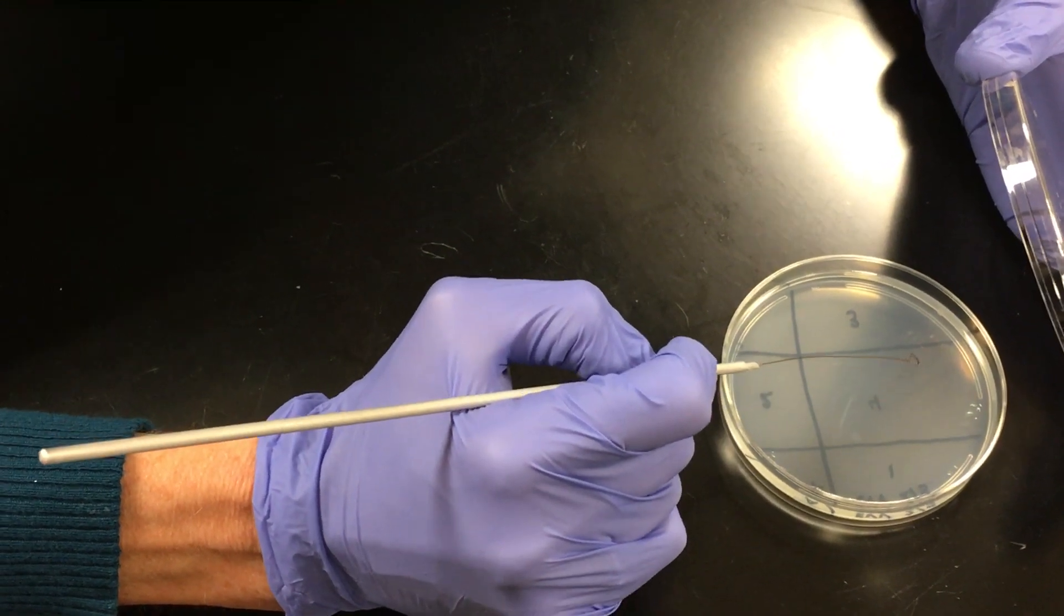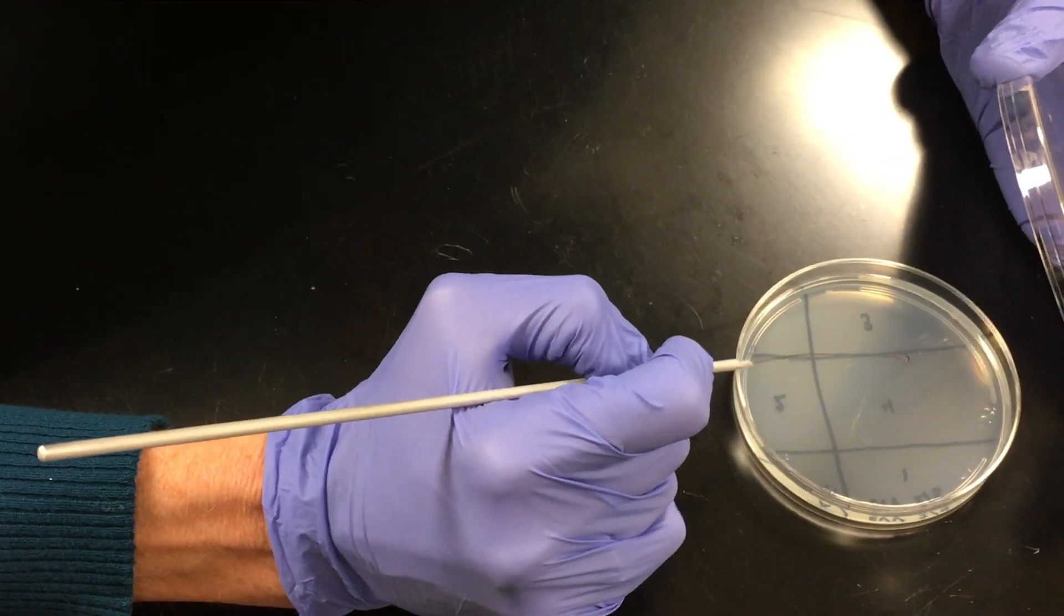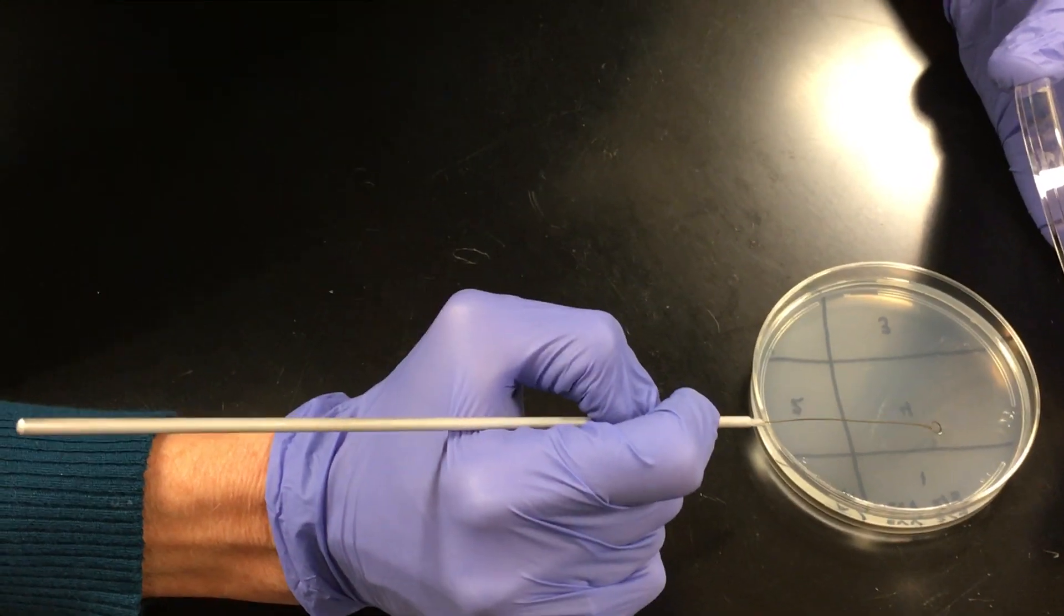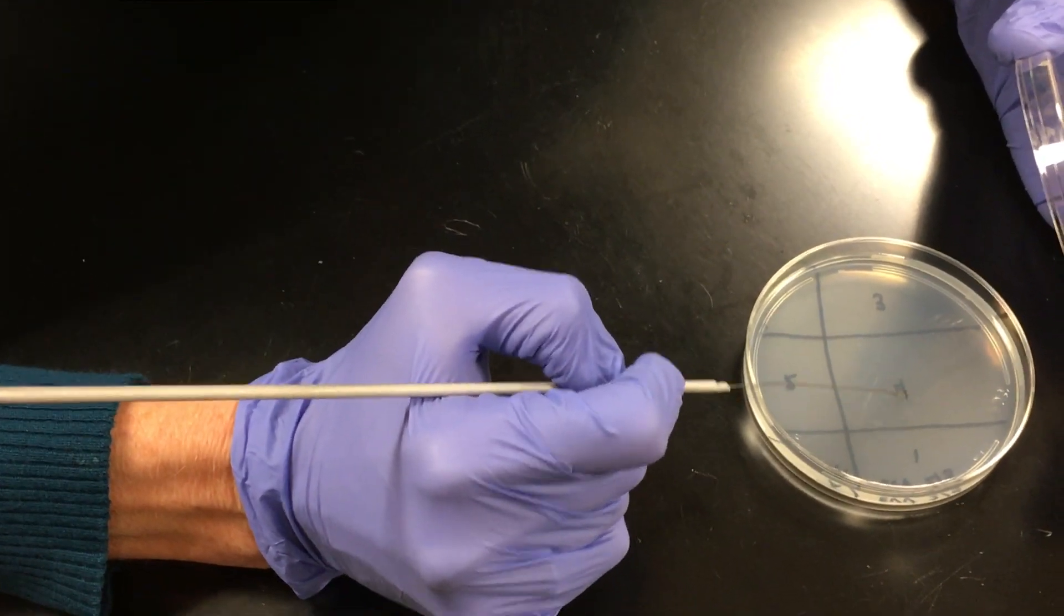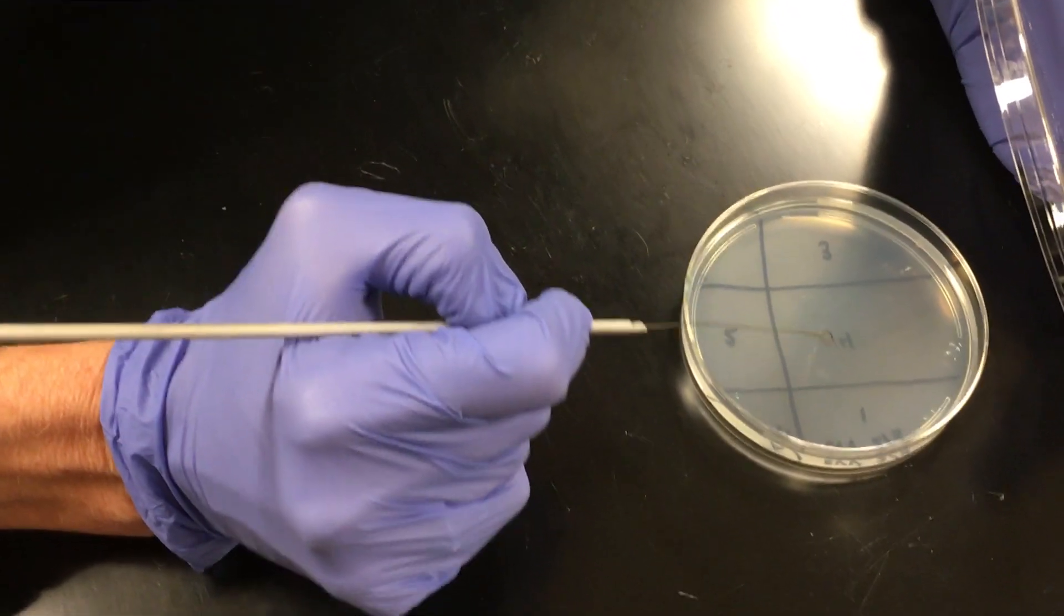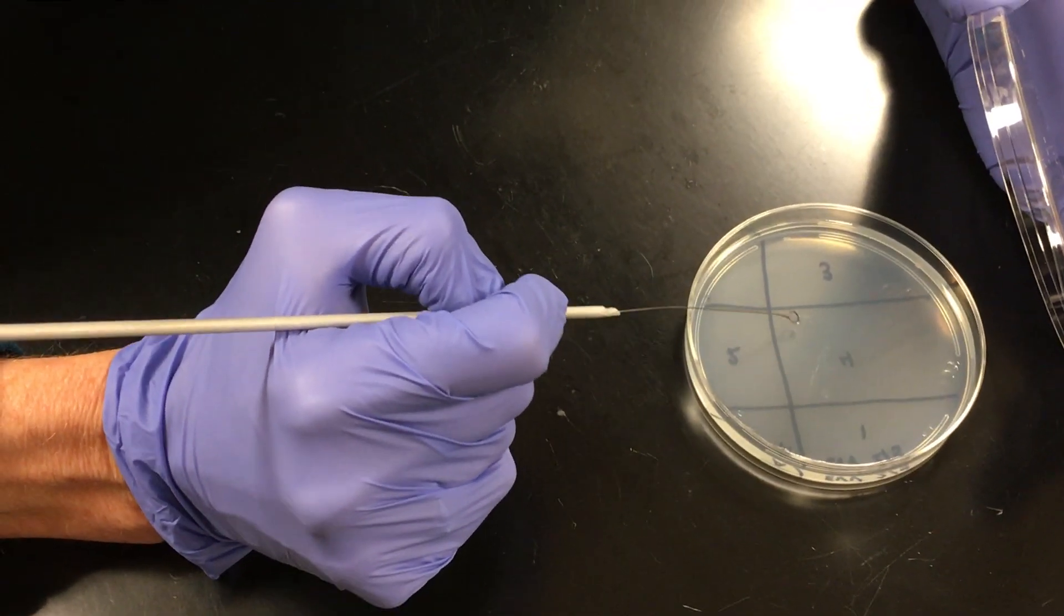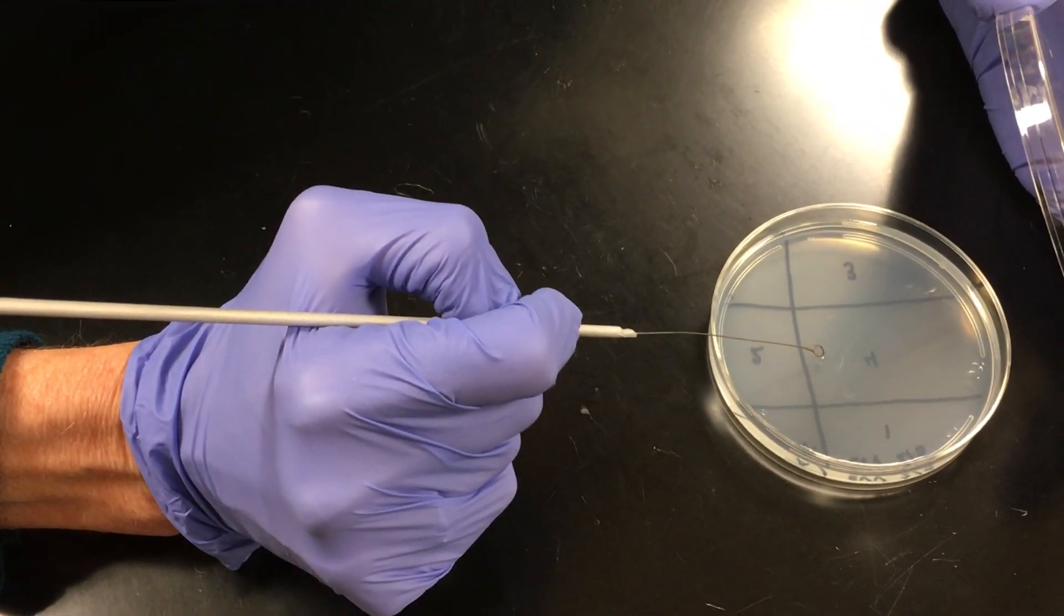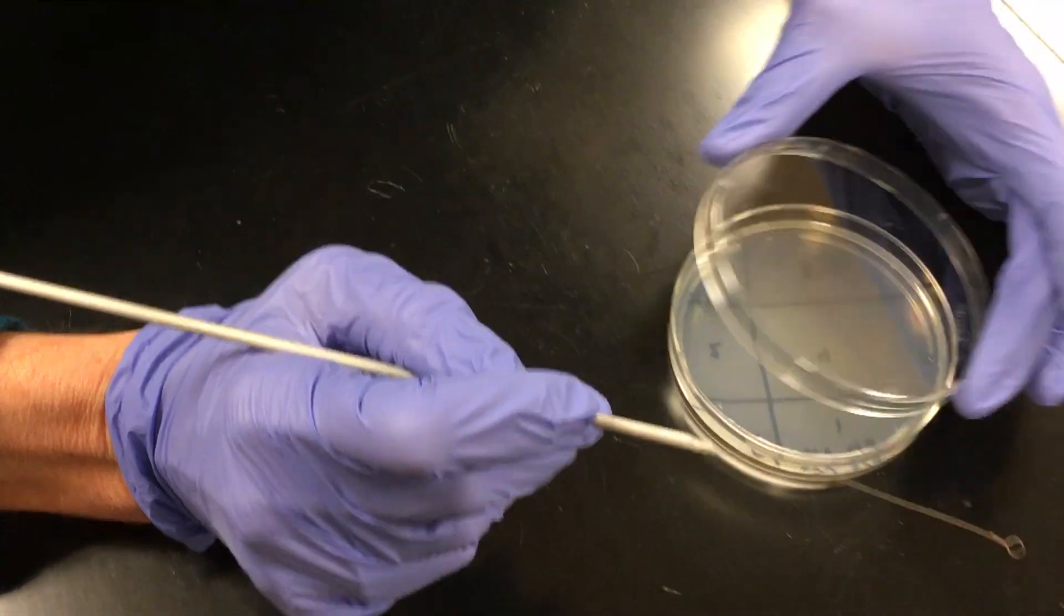Now I'm just going to streak across quadrant four and I'm trying to isolate bacterium so they form an individual colony. And notice I'm moving down that quadrant. I'm not crossing over my lines. Now I'm going to go as far as I can go without going into any of the other quadrants. Then I close my plate.